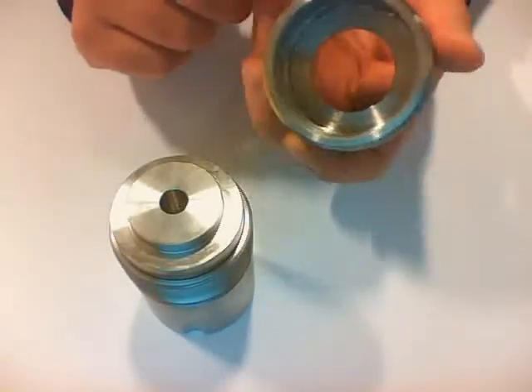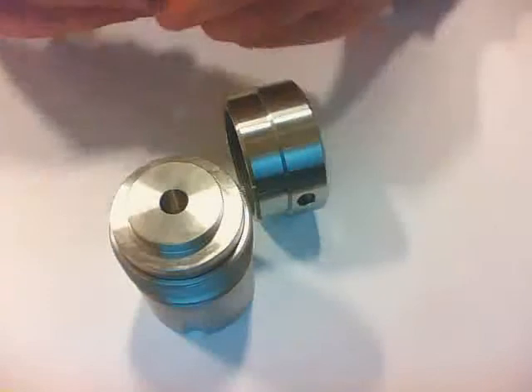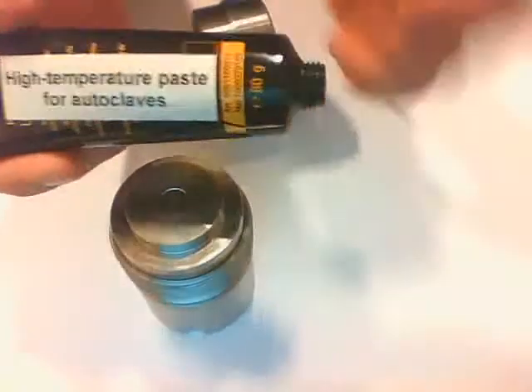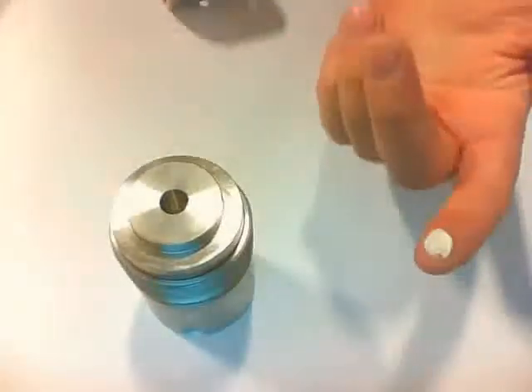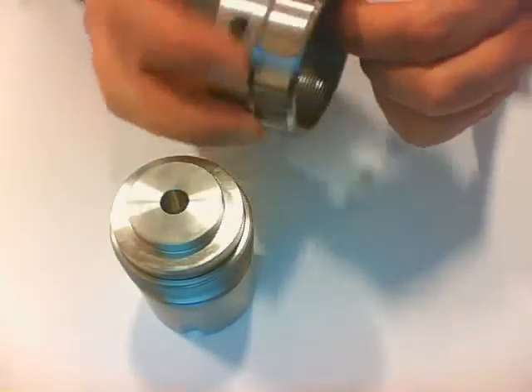Now I only need the lid, which has a very fine thread. To ease assembly and disassembly, we take a small amount of high temperature paste to grease the lid. I just need a very small amount and basically grease the initial part of the lid, so that once I start to screw the two pieces together it will grease the whole thread. The thread is quite long, so it takes a while to fix the two together.